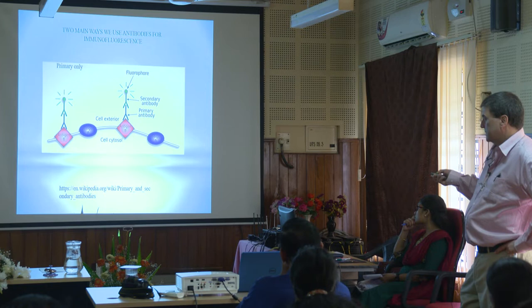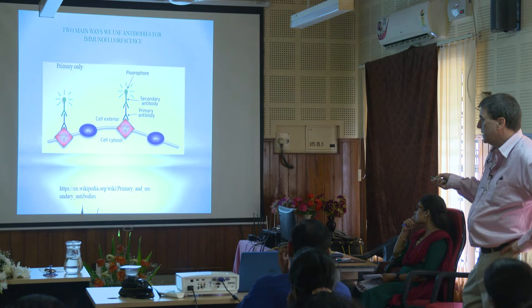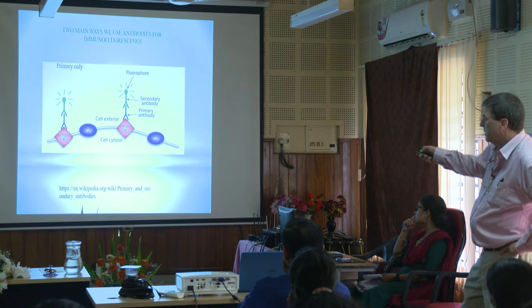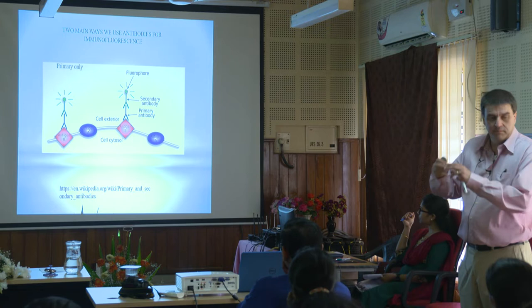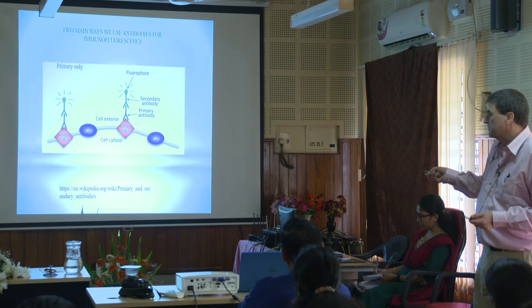What would happen then is you could put in a secondary antibody that just recognizes goat IgG, goat antibody. So you'd put these secondaries in, and they would only stick, supposedly, where you have the goat. The nice thing is there are multiple binding sites, so you could stick multiple secondaries on and expand that signal. You can make that signal a lot brighter. That's one of the big advantages of a primary-secondary system versus a primary-only system.